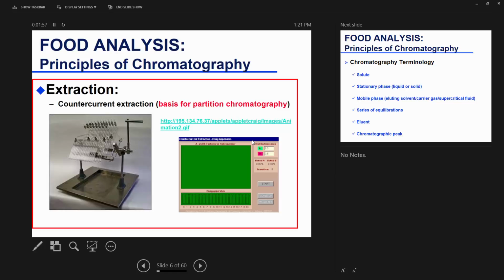If I had colored pens, I would have drawn the green and the blue, but you start seeing this is your B moving faster, coming out of your column faster, reaching a peak in concentration, and then your A will follow.